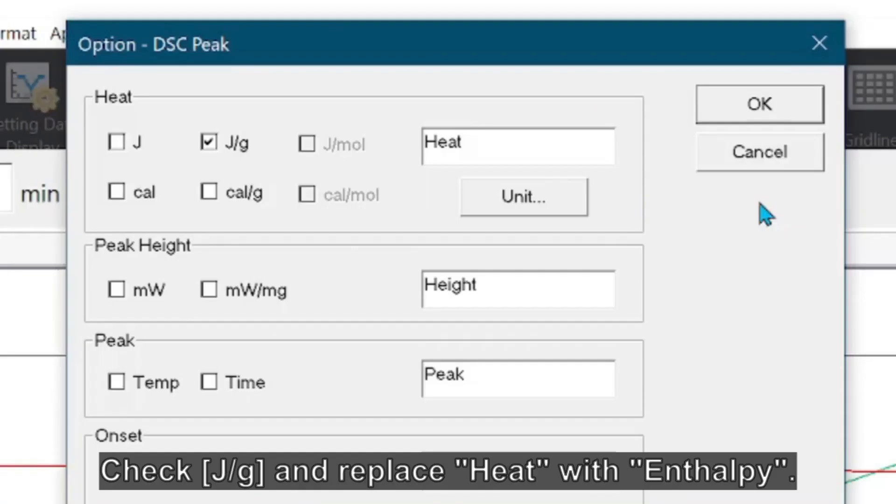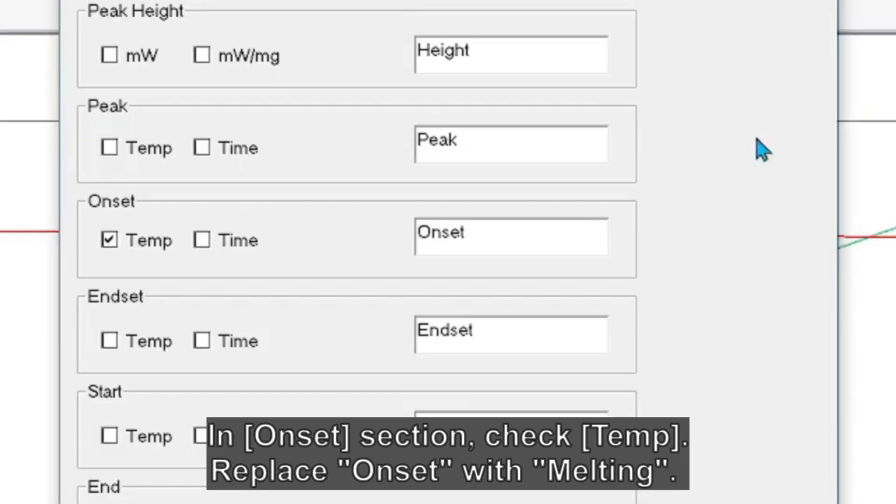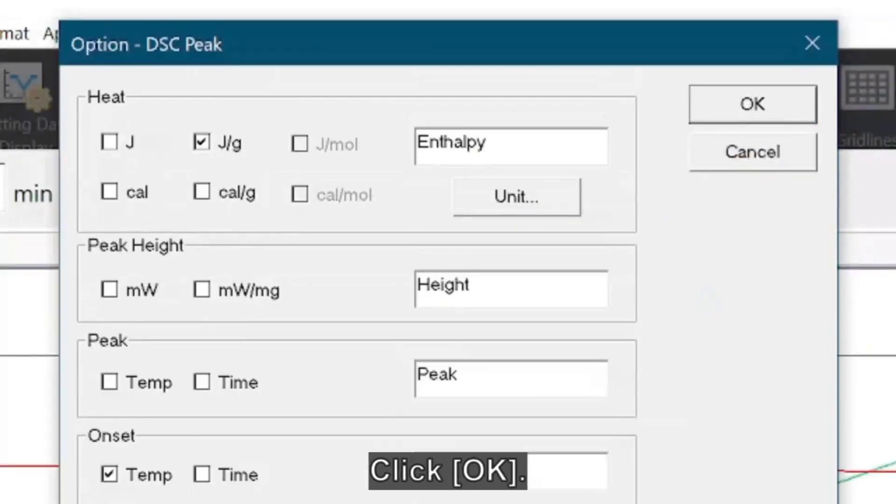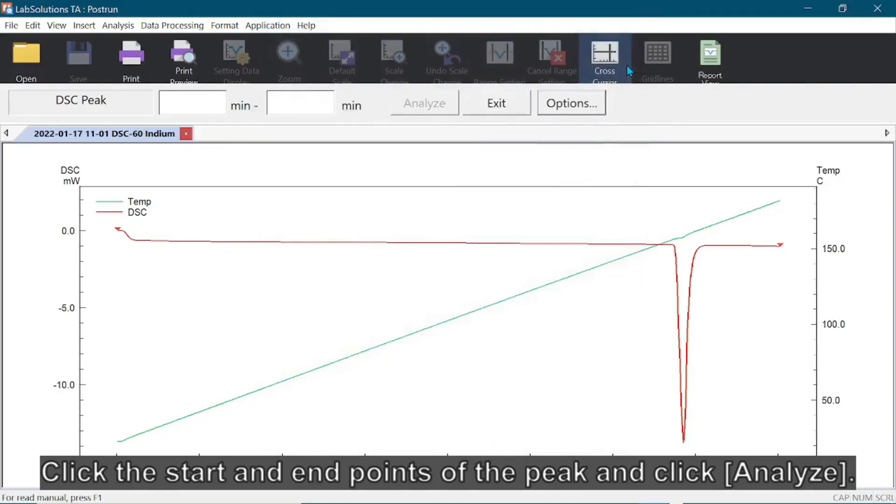Check the box for joules per gram and replace heat with enthalpy. In the Onset section, check the box for temperature and replace onset with melting. Click OK to close the window. Click the start and end points of the peak, then click Analyze.